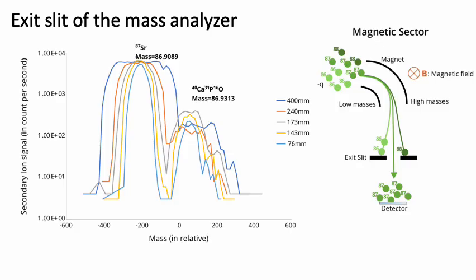Yes, yes, there are. So that's actually what this is. Here I want to talk a little bit about what the exit slit actually does. We can have slight variations in an imperfect magnetic field strength or accelerating voltage. This causes the exact position of the beam to wander, so that's one problem. The other problem is that you can have mass interferences from isobars.